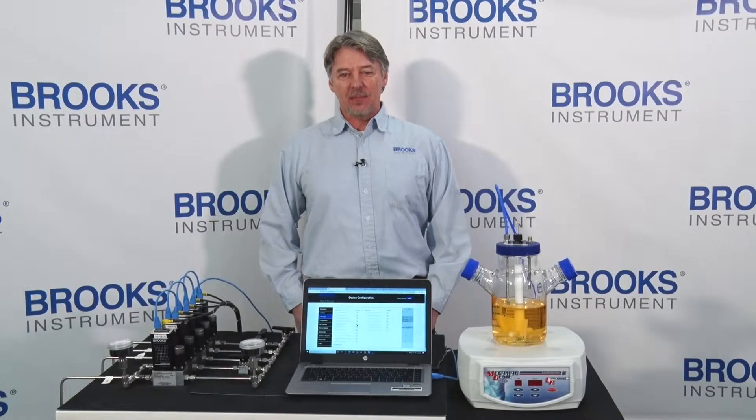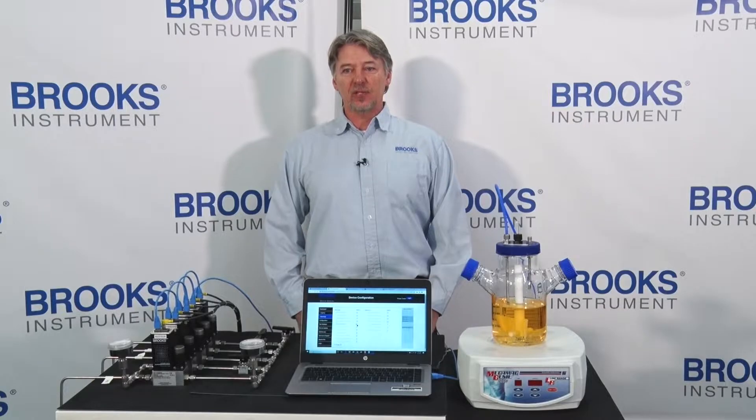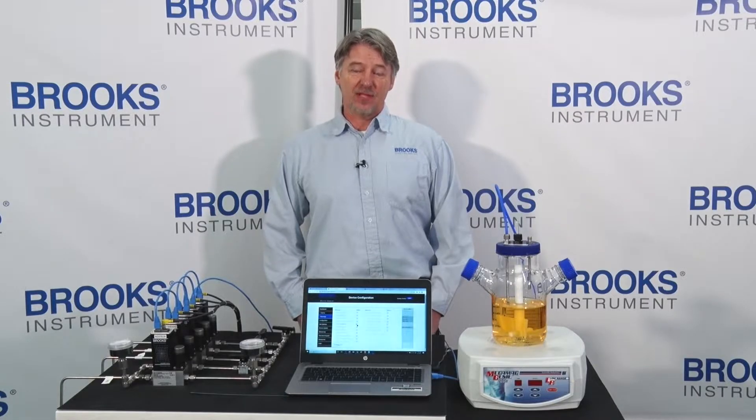Hello, my name is George Dorey. I'm part of the technical service team at Brooks Instrument. Today I want to talk about how you can utilize your Brooks Instrument thermal mass flow controller to potentially prevent damage to a bioreactor batch recipe.